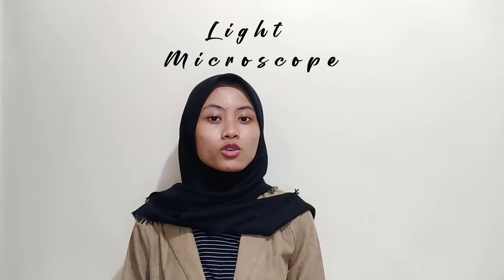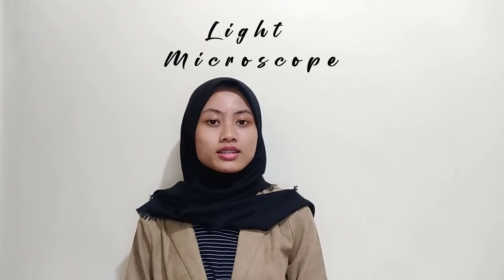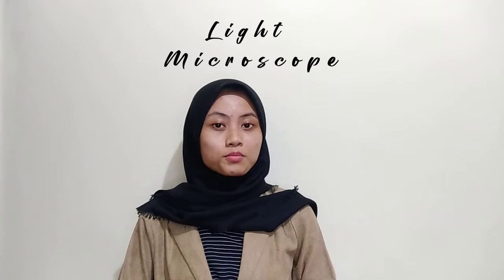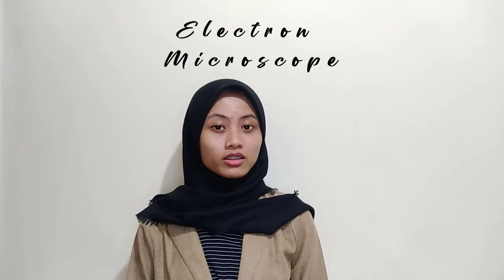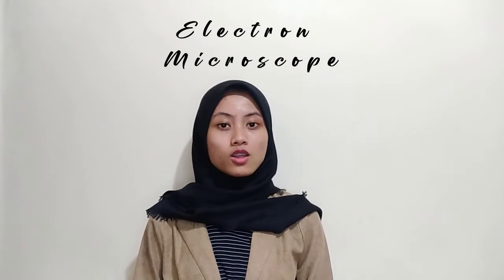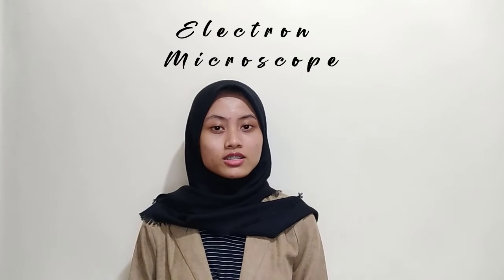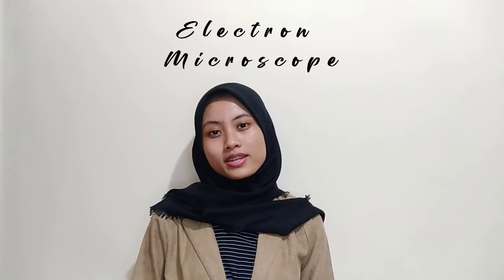The second type of microscope, based on the lens source, consists of a light microscope that uses a light radiation source to view objects. This light microscope is used to observe living and preserved specimens. An electron microscope uses electron beams instead of light and magnets instead of lenses, and is usually used in medical laboratories.